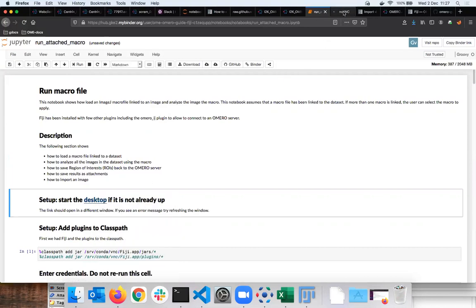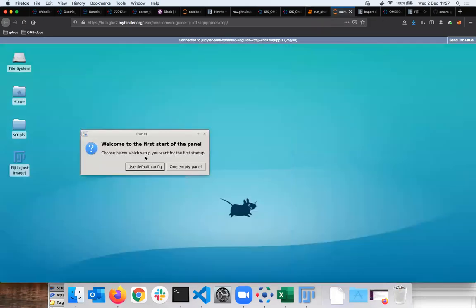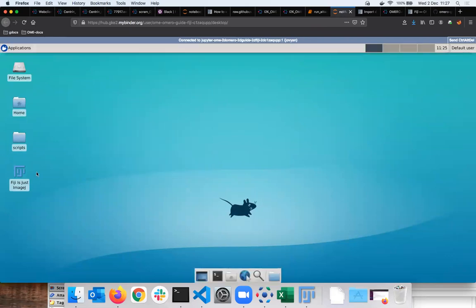I think it's a nice way when you publish data. Sometimes people say, I analyzed my data with X, Y, and Z, and it's very hard for someone to reproduce that analysis or even to set up the same environment. On a side project we are starting to host our own system to offer more resources for that. But it allows you to show what can be done against your data.